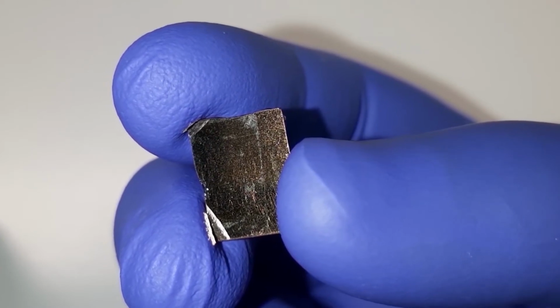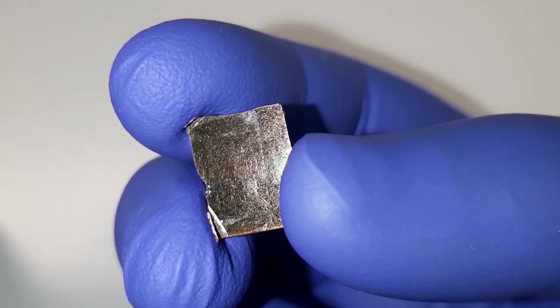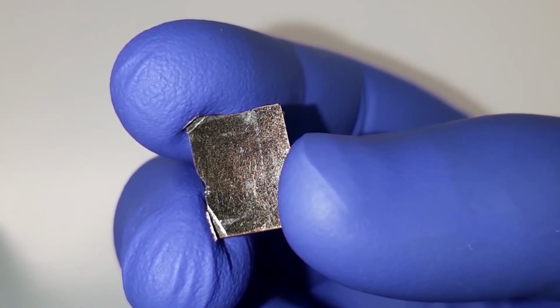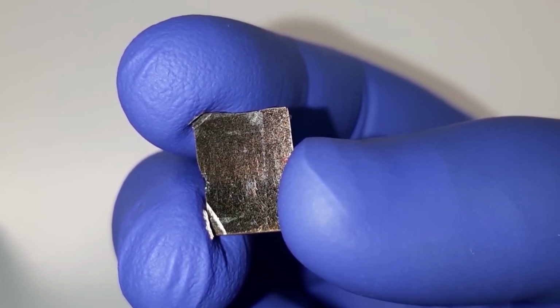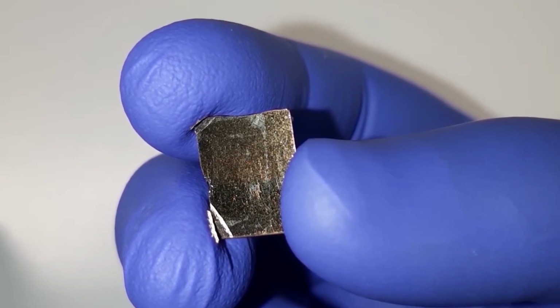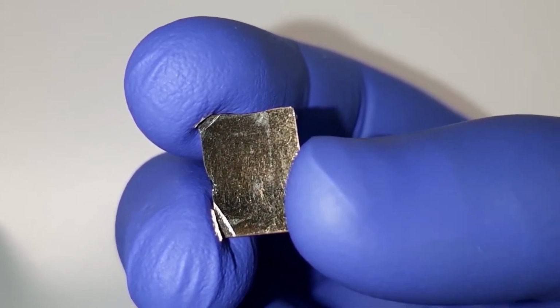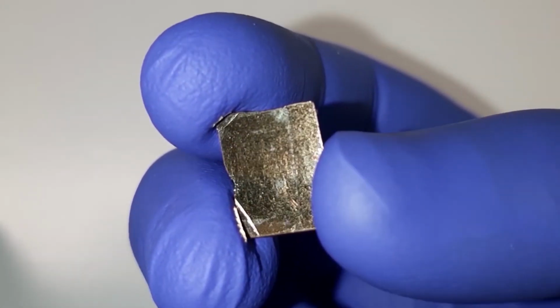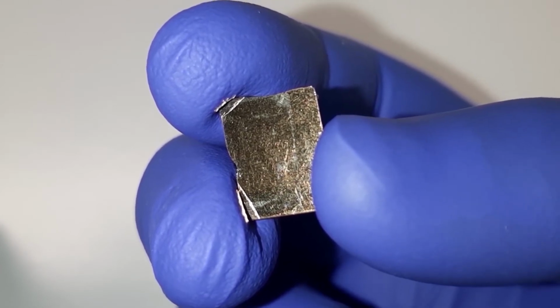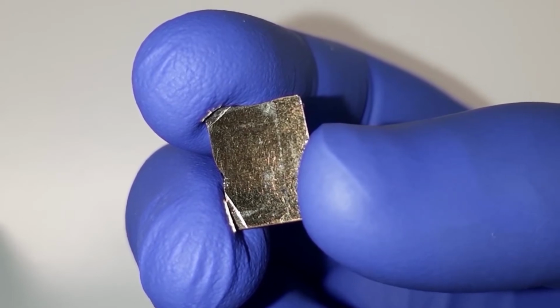The second one is the gold sensing layer, and this gold film has a thickness of around 50 nanometers. The size of this chip is 9 by 13 millimeters. Normally, we use exactly such chips in our routine detection of biological or non-biological nanoparticles.